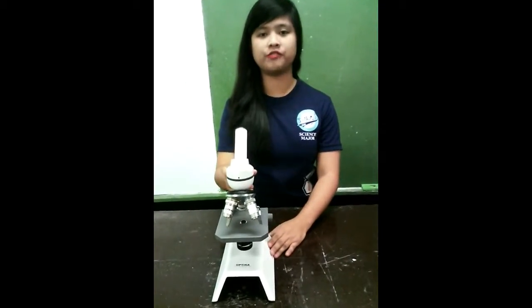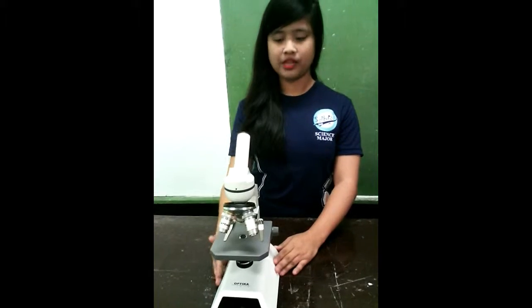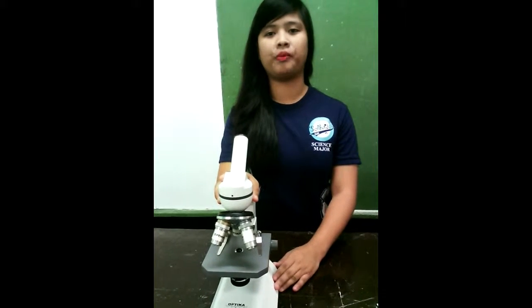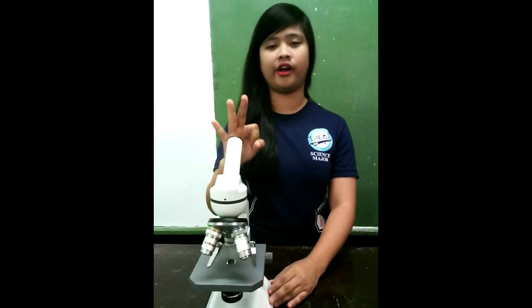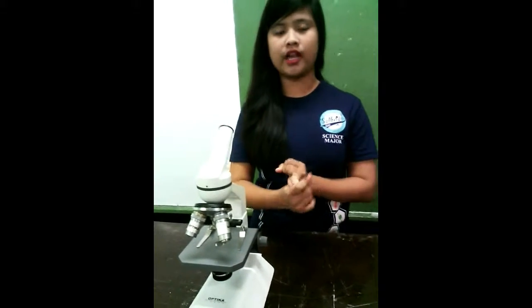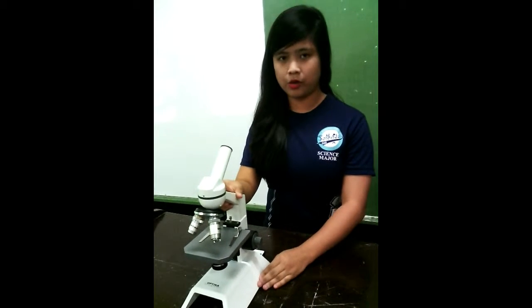Let's proceed to the parts of the compound microscope. The parts are classified into three major parts, which are the mechanical part, the magnifying part, and the illuminating part. And we will discuss it one by one.